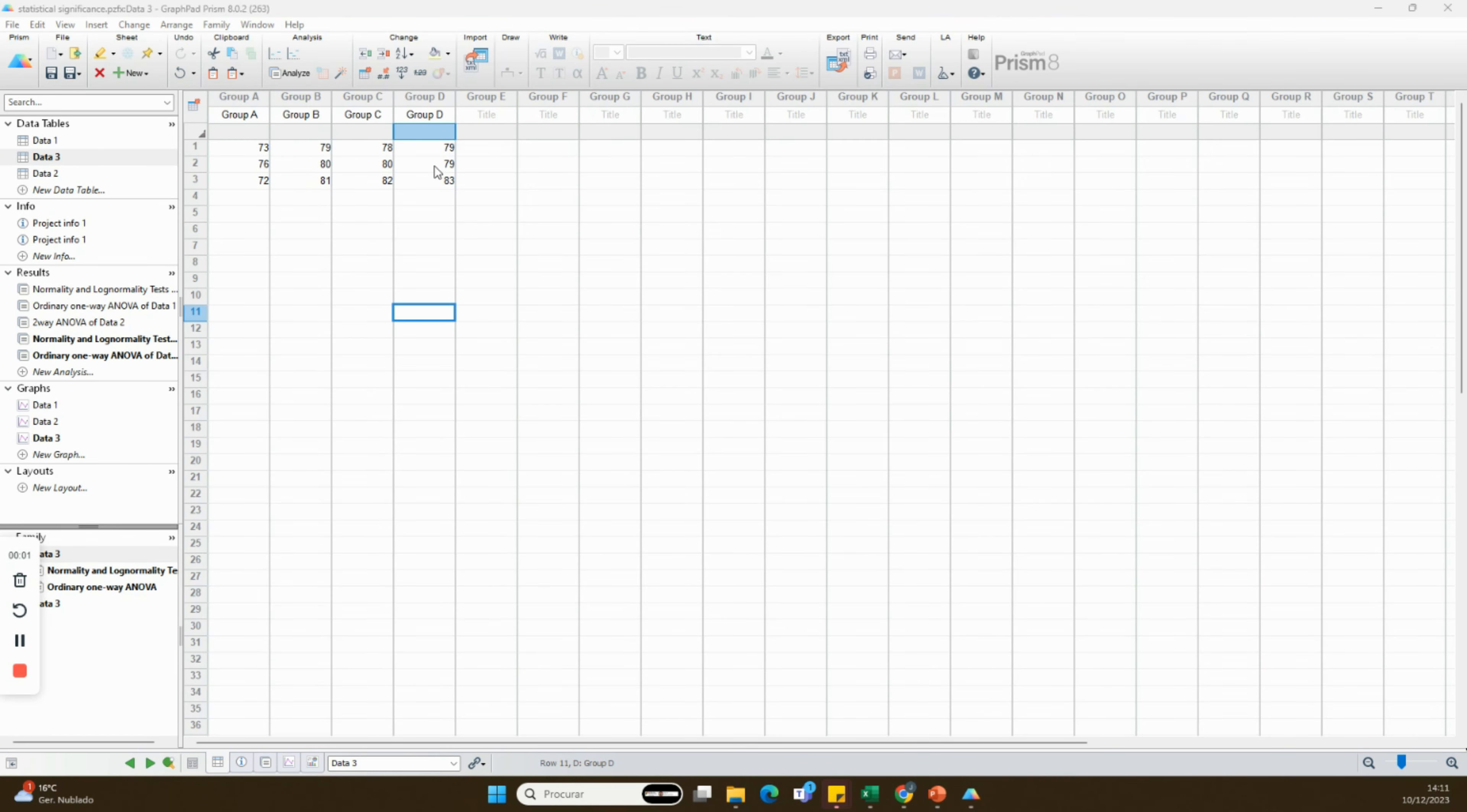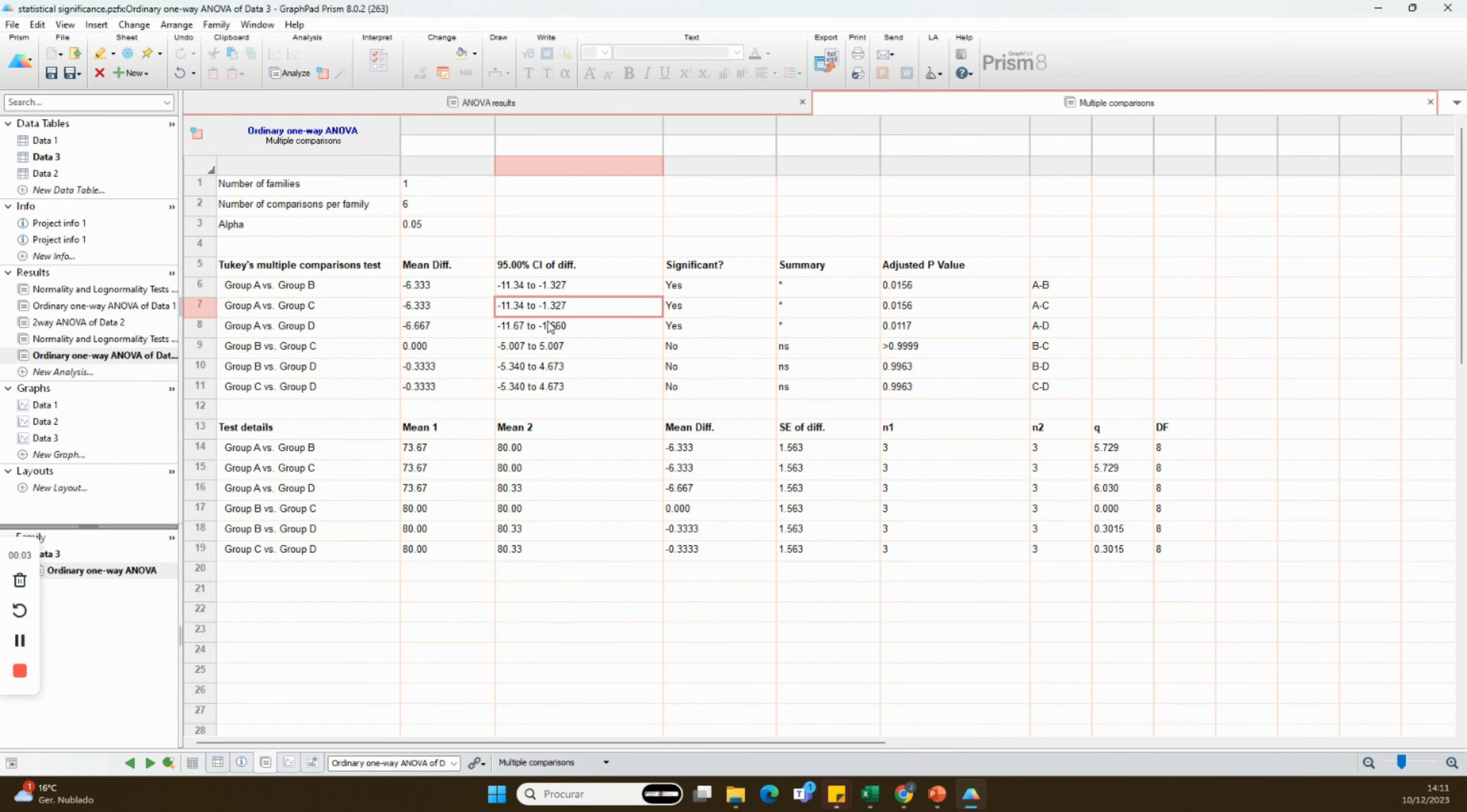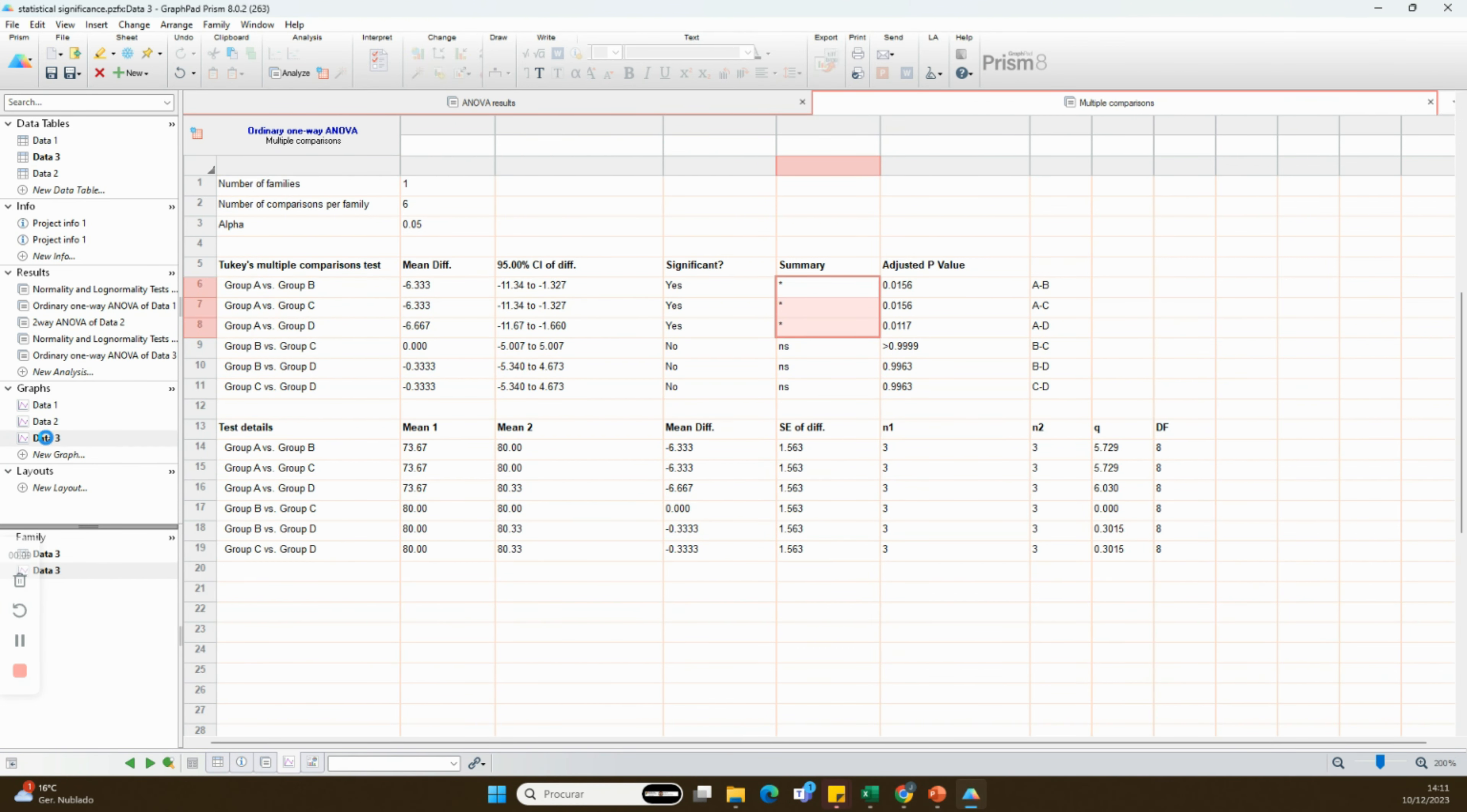However, feel free to choose any symbol, although the asterisk is the more consensual one.